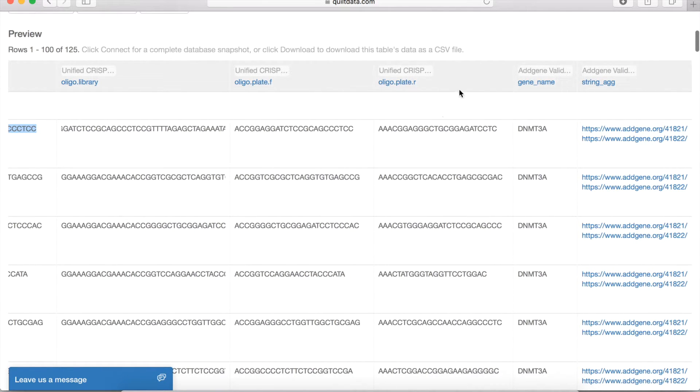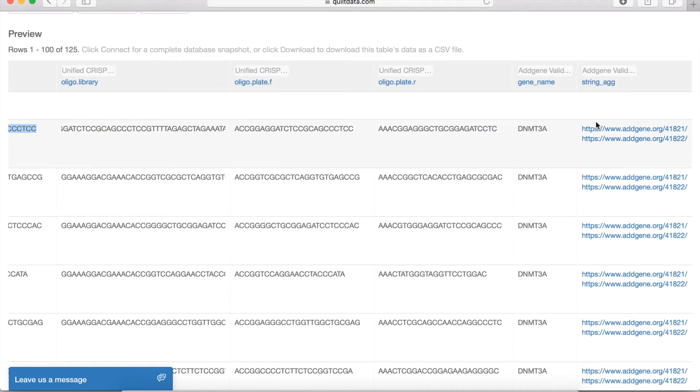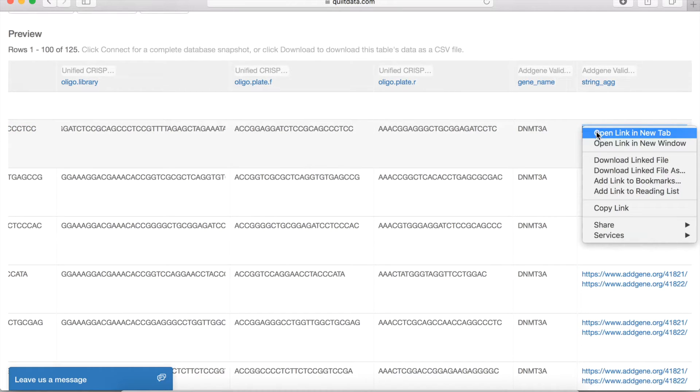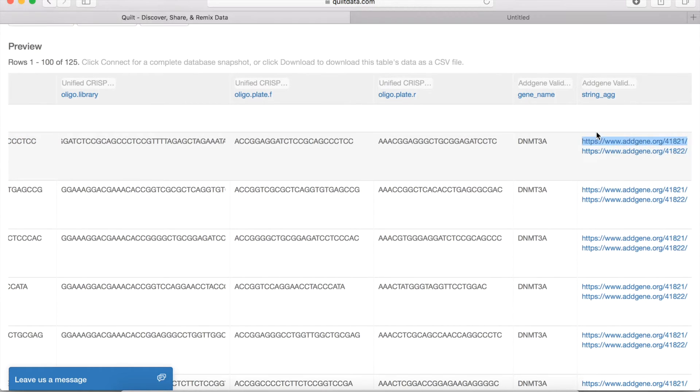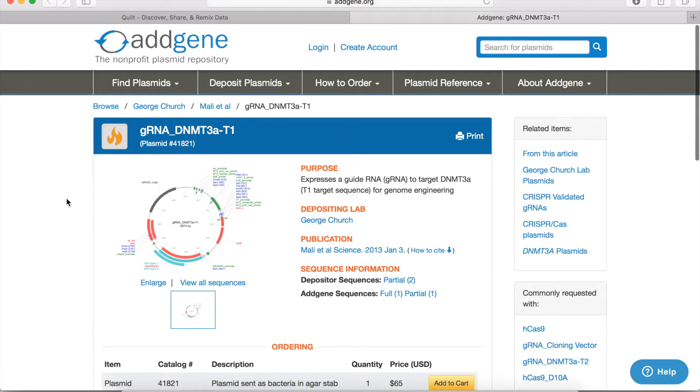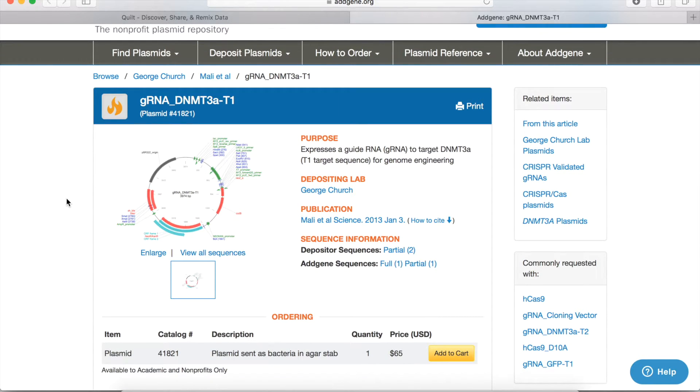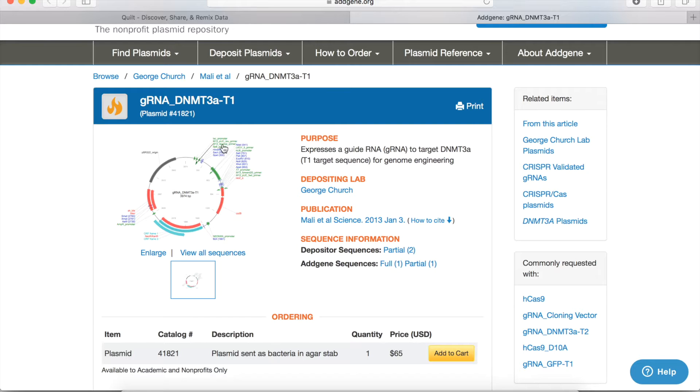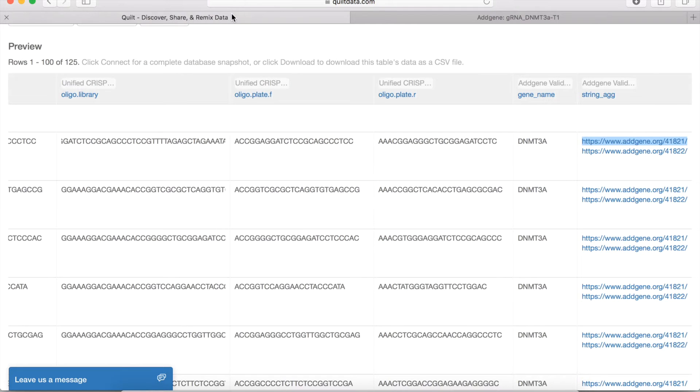And the last thing to note here is that if there is a pre-validated guide RNA design that is available at AddGene, we link you directly to that. So AddGene has a repository of many guide RNAs that are validated and published upon and which are available as plasmids that you can purchase, so we'll link you directly there.